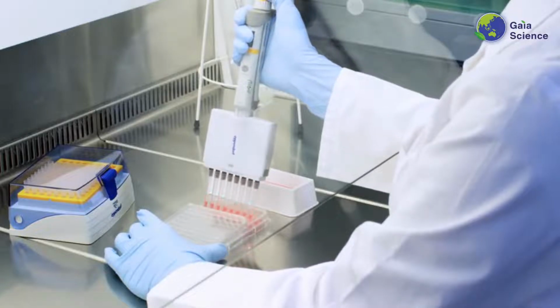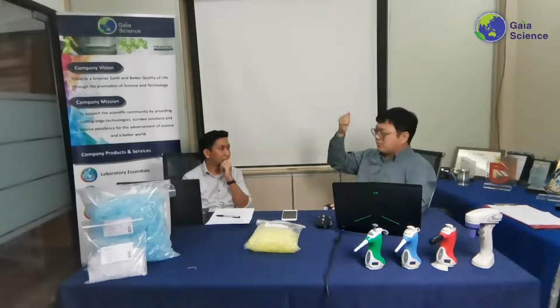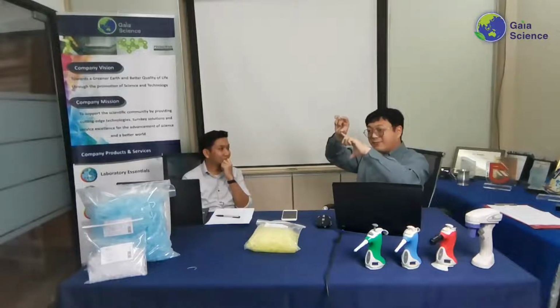But other work may be to mix and so on. Sometimes we work with very short Eppendorf tubes, and then we just need a very short tip. However, there are situations where you need it long. Depending on your pipette, maybe the shaft is too short, so the long tips would compensate for that. If you imagine your shaft, then short tip, long tip.